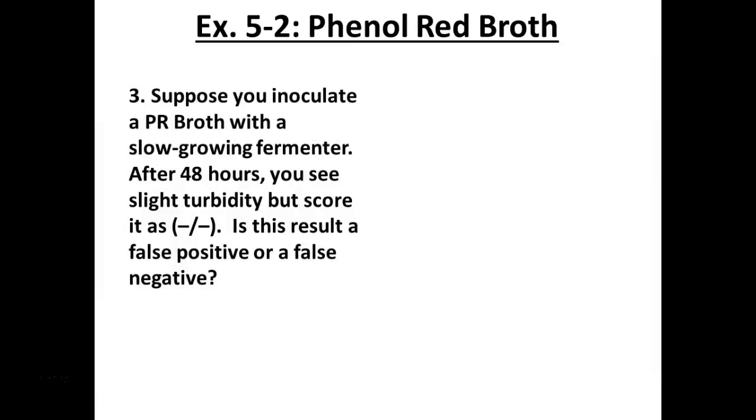So, suppose you inoculate a slow-growing fermenter. After 48 hours, the tube, if it's minus, what does it look like? What color is it? Or orangey, right? No gas. But I already told you it's slow.